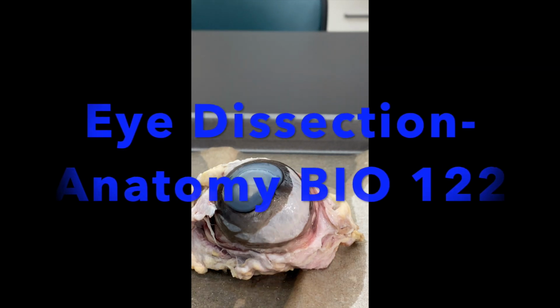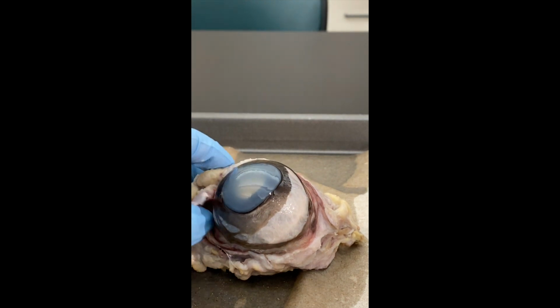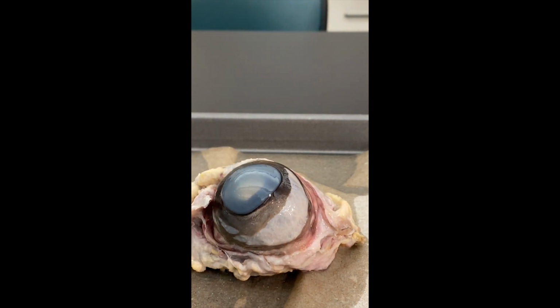Hello there. In this video, we're going to go over the required structures of the eye. So if you turn to page 53 in your lab packet, you will be able to see a list there of all the structures you should be able to identify and spell correctly for the first practical. So we'll start off with the external structures that we can visualize here.